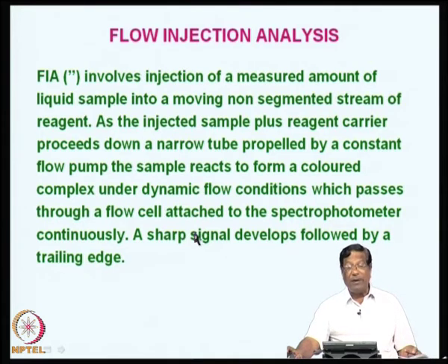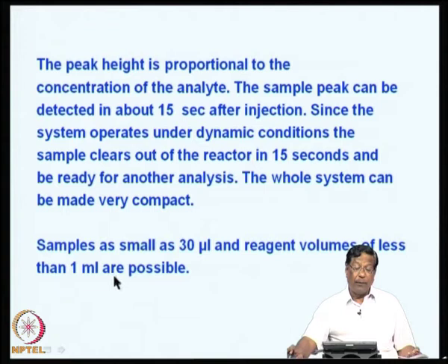So, a sharp signal develops followed by a trailing edge. The peak height would of course be proportional to the concentration of the analyte. The sample peak can be detected in about 15 seconds after injection.